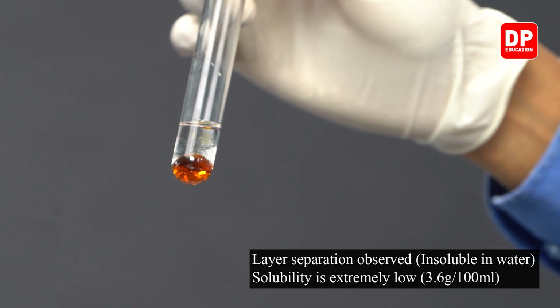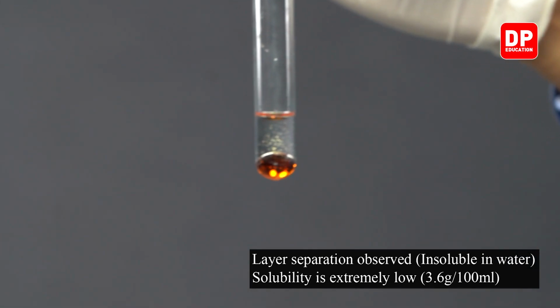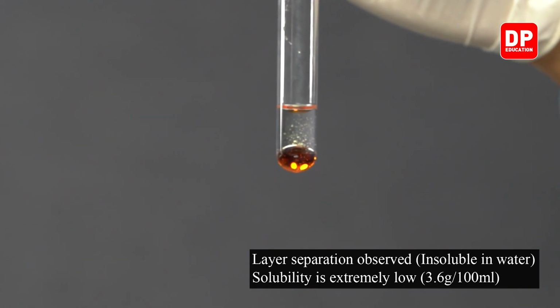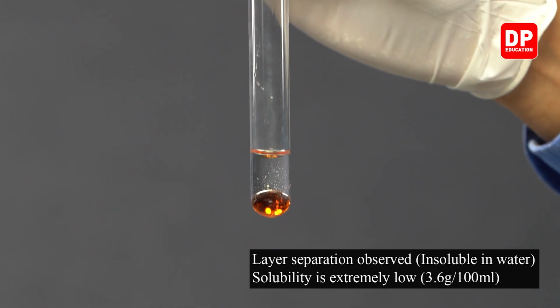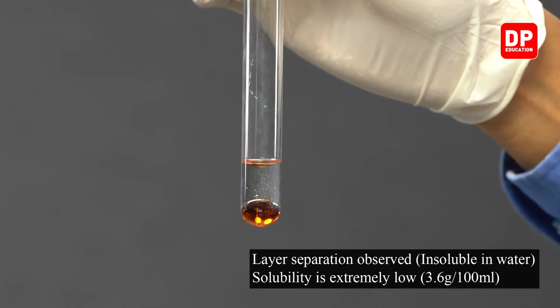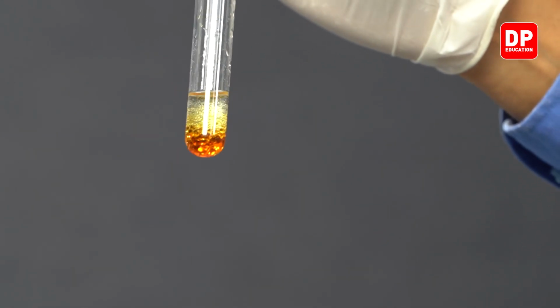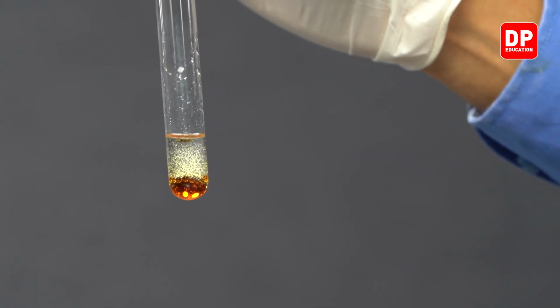As you can see, when a small amount of water is added, it is not forming a homogeneous solution. It is forming two layers, indicating that aniline is not soluble in water. Even if you mix it, we can see small droplets of aniline form, and then they come together to form a single layer of aniline.